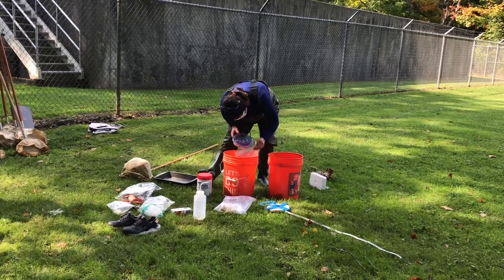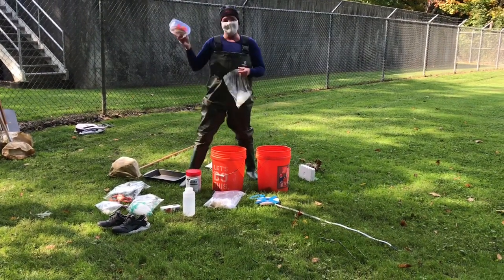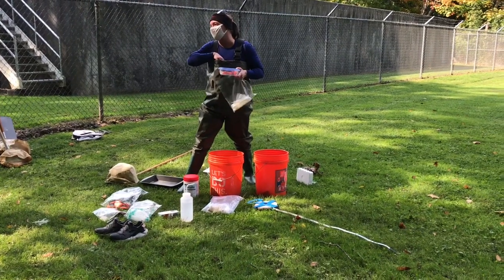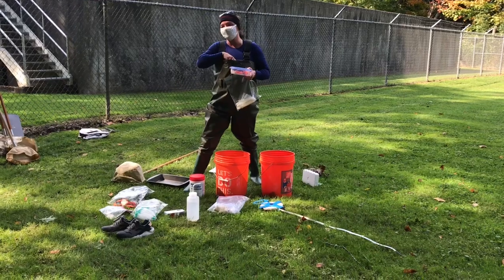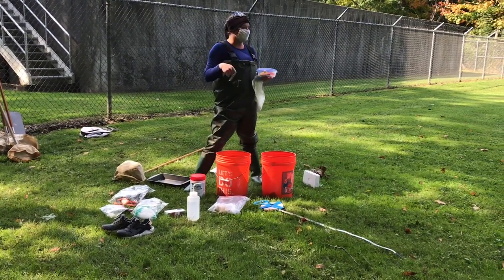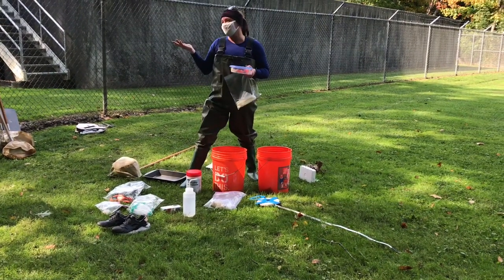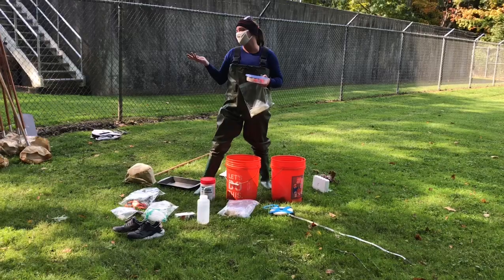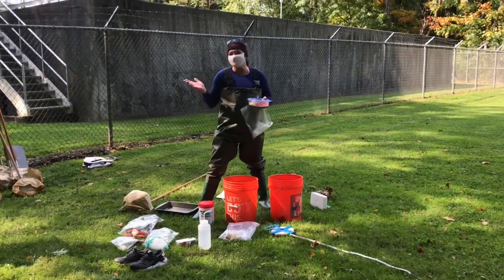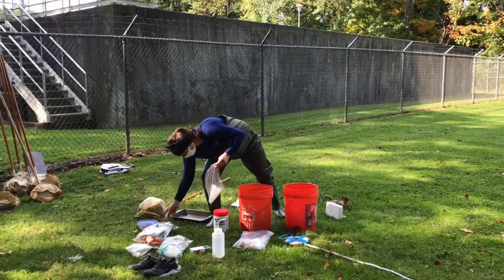To collect invertebrates off your nets and out of your trays, there are forceps. Please keep the forceps in your inside pocket if you're not using them. What happens is that people set them down on the ground, someone steps on them, they get buried in the sand, and forceps are decently cheap, but I don't like a lot of eco waste. It's not good for us to do ecology and then leave things in the field. So there are forceps here.